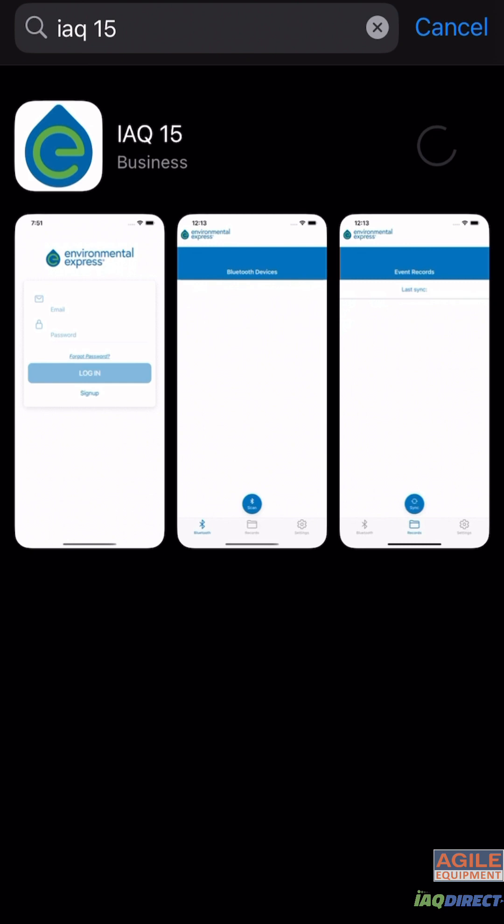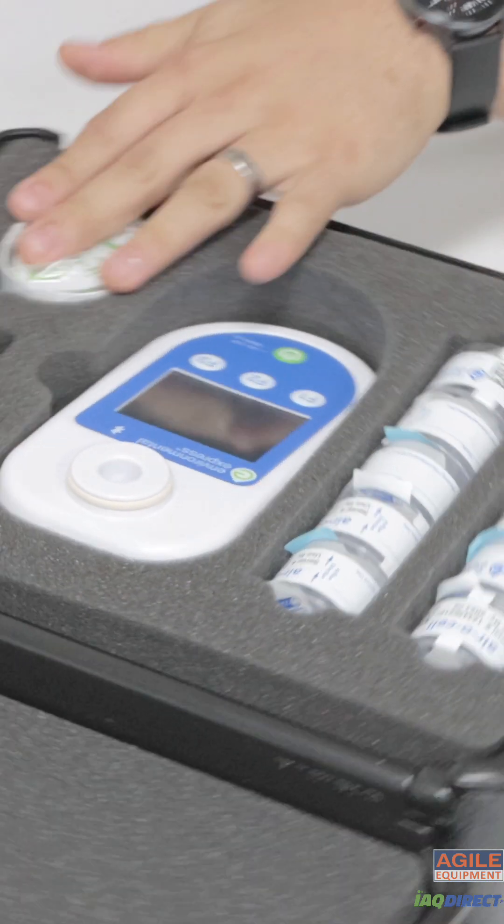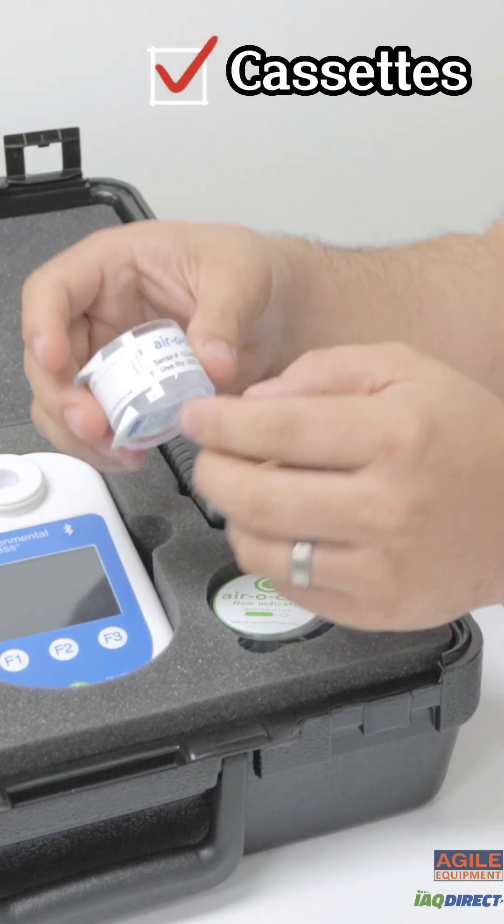Record sample results accurately by using the IAQ 15 app to receive test results. The IAQ 15 Connect comes in a ready-to-go hard case which contains a power adapter, an Air-O-Cell air flow indicator, 10 Air-O-Cell cassettes, and the IAQ 15 Connect pump.